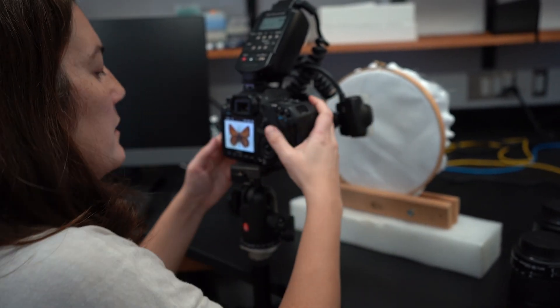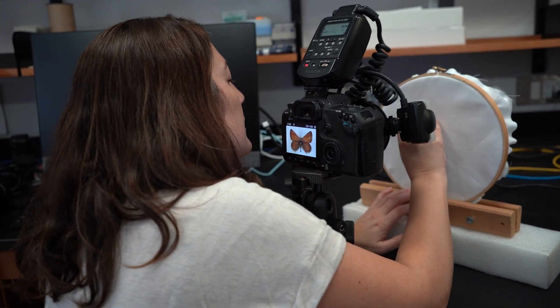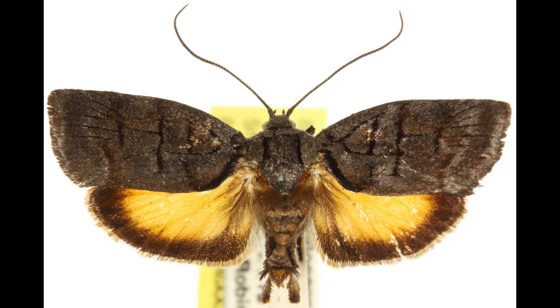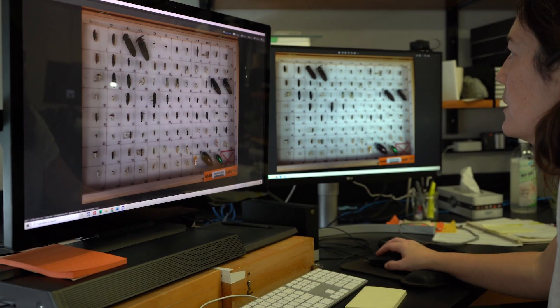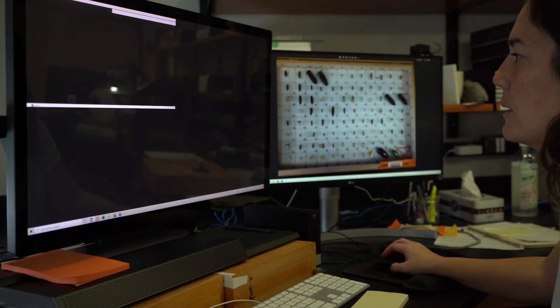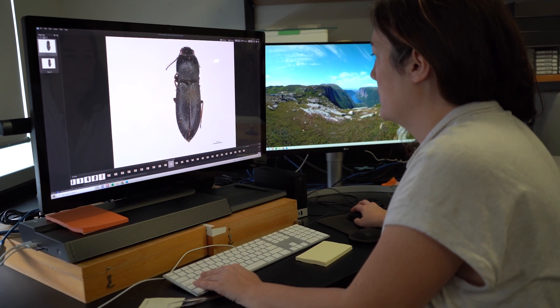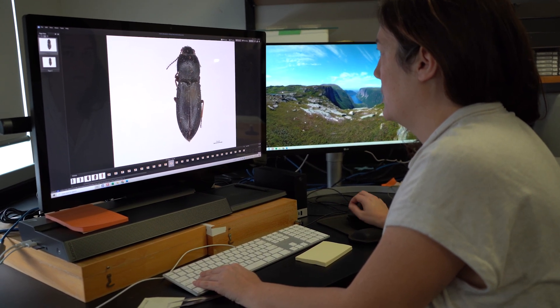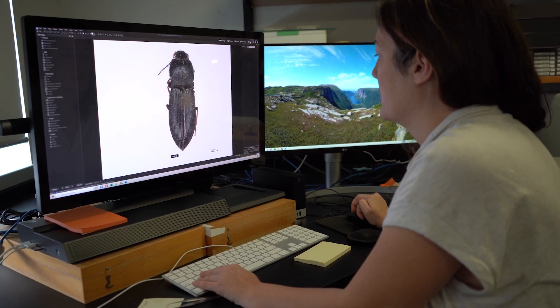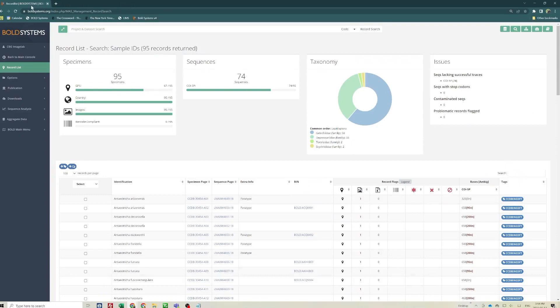It's recommended to take one image per specimen to avoid errors. However, BOLD allows up to 10 images per sample ID if needed. The specimen should take up the majority of the frame and be in the center. There should be no extra white space. Image all 95 specimens in the array, then upload to your computer. Once uploaded, rename each image by their sample ID. Next, edit any images that require cropping or rotating. Images should be cropped at a 4 to 3 ratio. Finally, upload your images to BOLD using the image data file included in the CCDB kit. Check out the BOLD reference guide for image upload instructions.